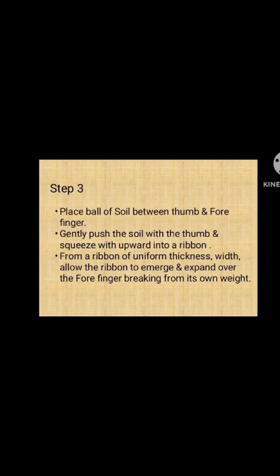Step 3 in the procedure. Place the ball of soil between thumb and forefinger. Gently push the soil with the thumb and squeeze upward into a ribbon. Form a ribbon of uniform thickness, and allow the ribbon to emerge and extend over the forefinger, breaking from its own weight.